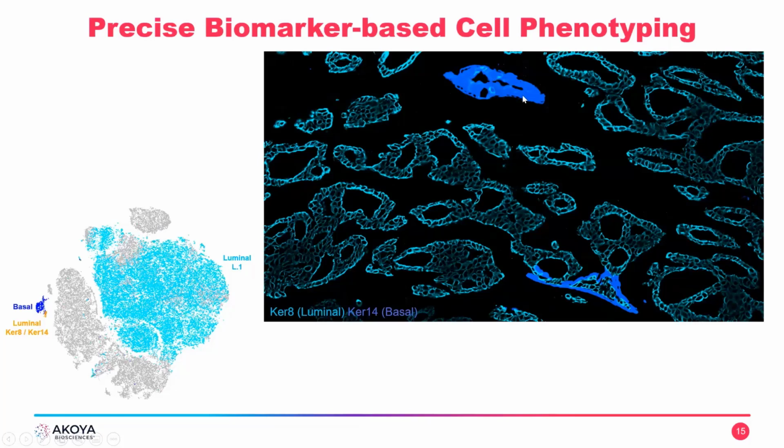Now, if I would look at just this image, I would probably dismiss it because it is actually, by my admission, ambiguous. Maybe this has just been overexposed. Maybe the keratin 14 marker is just so strong that it washes over and these cells just happen to be labeled. Maybe it's the same as down here where you can see really nice basal layer and you also have cyan cells. So what's different between this and that?